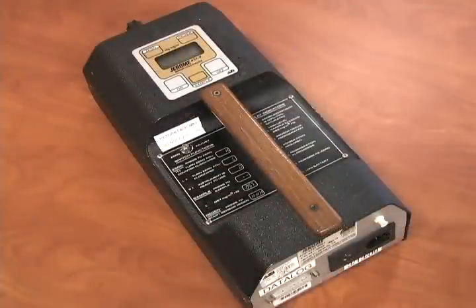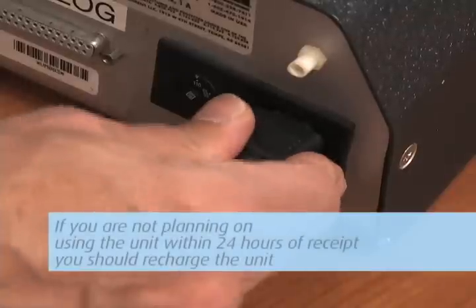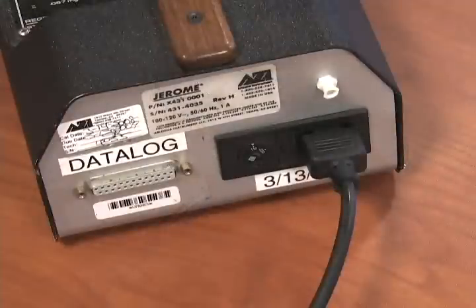The unit operates on rechargeable batteries and will run for approximately 6 hours on a single charge. The unit will come fully charged and ready to operate. If you are not planning to use the unit within 24 hours of receipt, you should recharge the unit by attaching the charger to the unit and to an AC outlet. Let charge overnight.